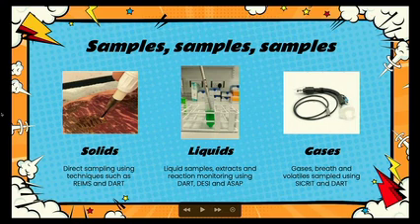It means that you can simply take a tissue sample, whether it's a cancer biopsy or whether it's, in the case of stuff that I've done a lot of, meat samples, beef, chicken, horse, those sorts of things. With an electrosurgical knife, a diathermy instrument of some description, it generates smoke, and you can even use something as simple as a soldering iron. It doesn't have to be anything quite as sophisticated as a surgical knife.